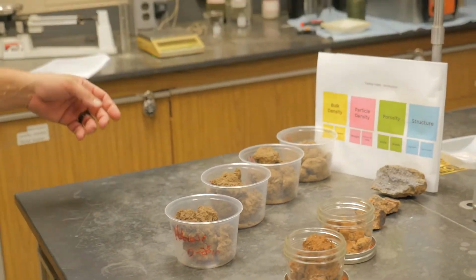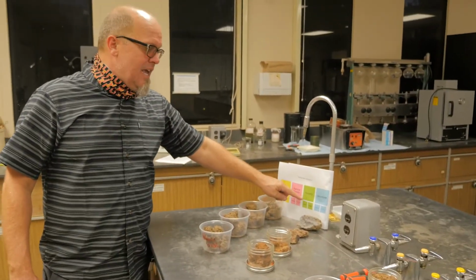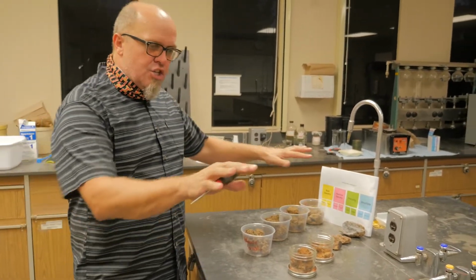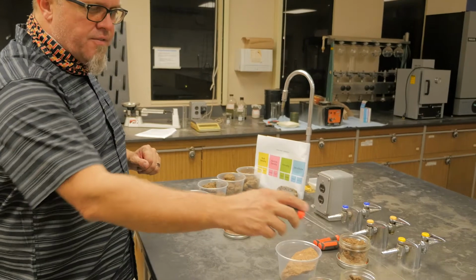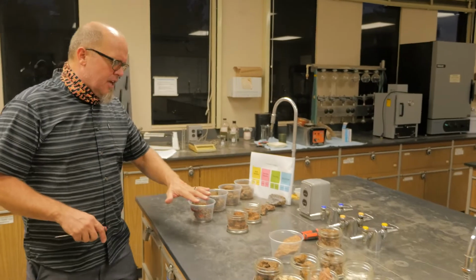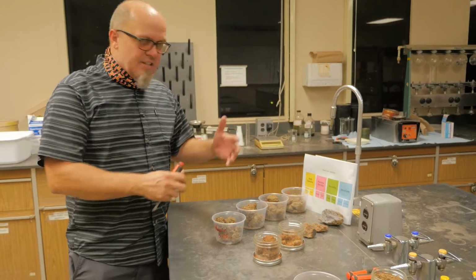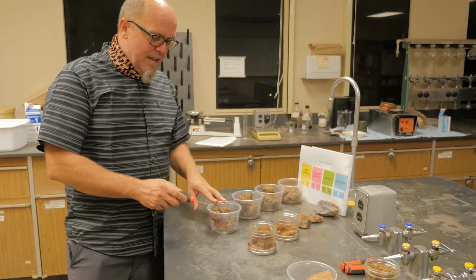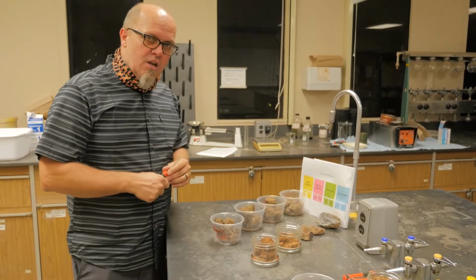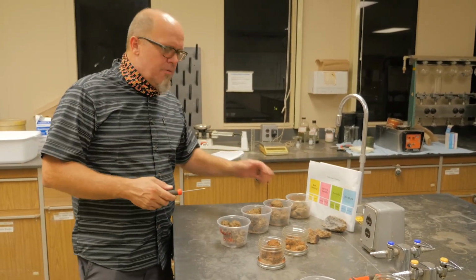What we're going to talk about today in this lab in general are bulk density, particle density, porosity, and structure. And we should be able to get pretty good footing across all of those topics just from these samples that we have here. A bunch of irregular and unique ones with weird staining and different features, and then being able to think about these two sets of samples systematically. We'll be measuring bulk density on each one of these and thinking about them on each of these samples to show you how those features change with depth related to those forming factors that we talked about and flux of material and the accumulation of material in the subsoil.